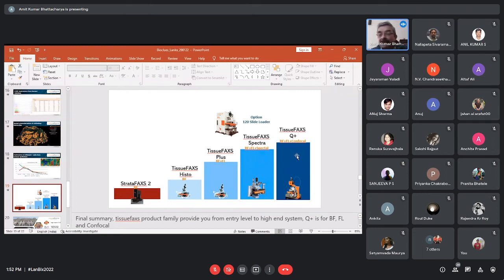What a confocal microscope allows you is to look at a thicker section, and a thicker section is important because it allows you to collect data from more cells. A confocal allows you to identify and visualize single cells in thick sections and collect data. As I told you, this is essentially about looking at data on a single cell basis from populations and subpopulations. There could be some subpopulations which are very small, composed of only, let's say, 200 cells, and therefore it helps if we collect data from a thicker section, so our data will be more statistically reliable.